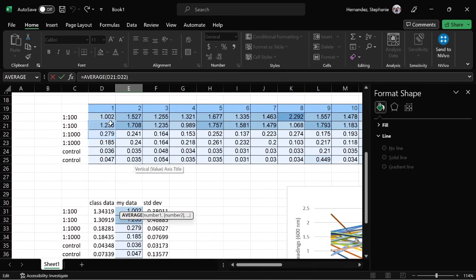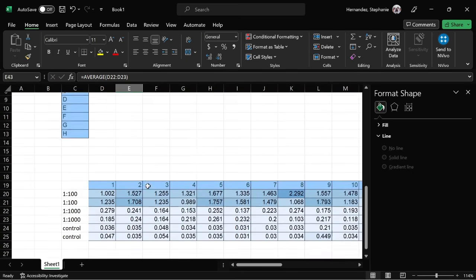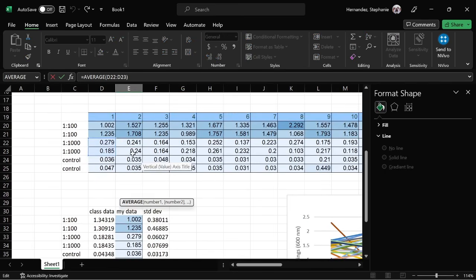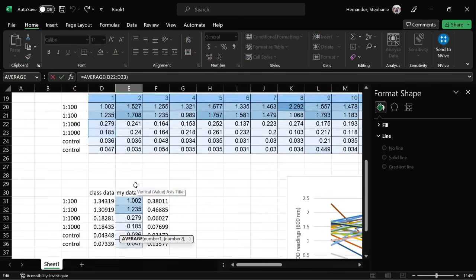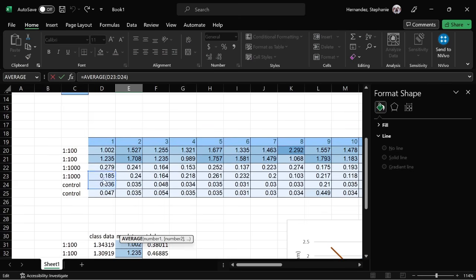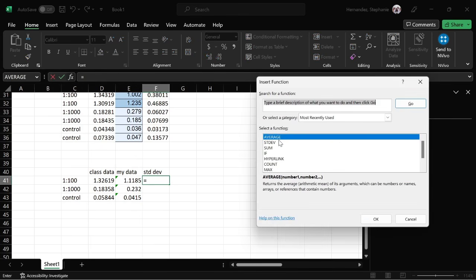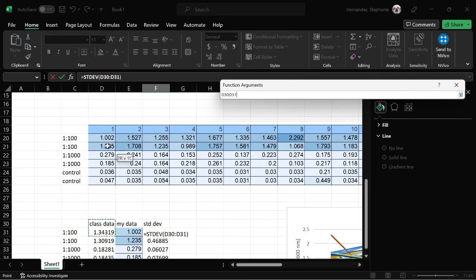No, it did not. So yet again, I just drag it to what I actually want the pattern to be. So click it. This one also did not pick up on the right pattern, so I'll just help it out. But yet again, it still does save time because you're not actually having to write out the formula. There we go. And then same thing for standard deviation. We're just using the stdev formula instead.